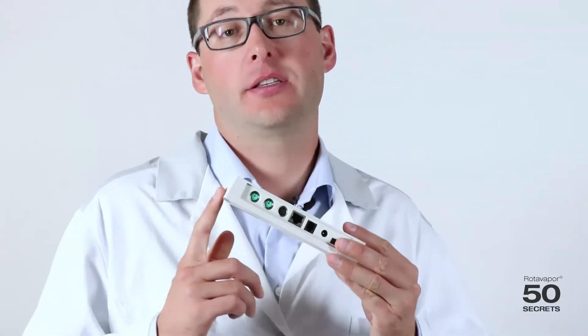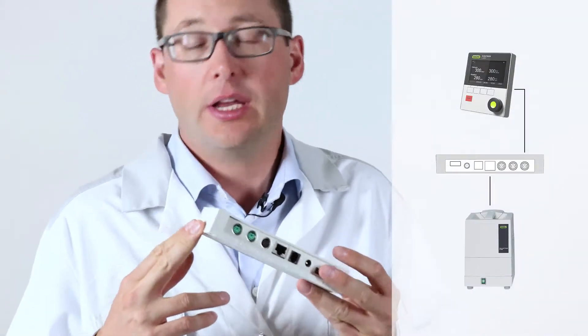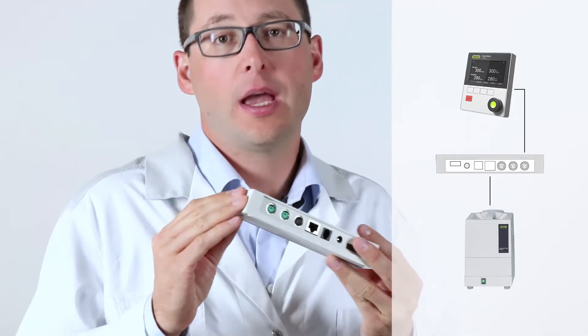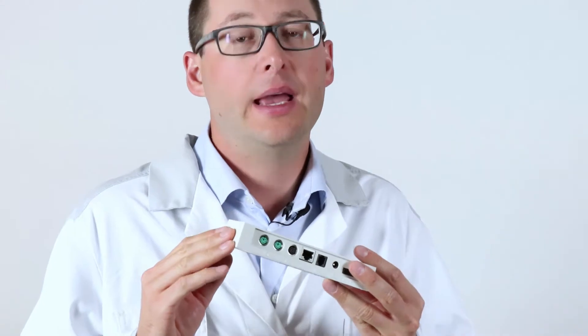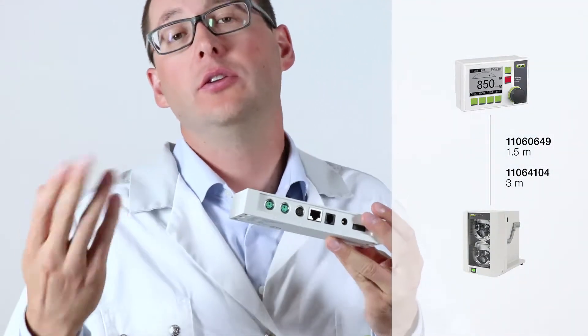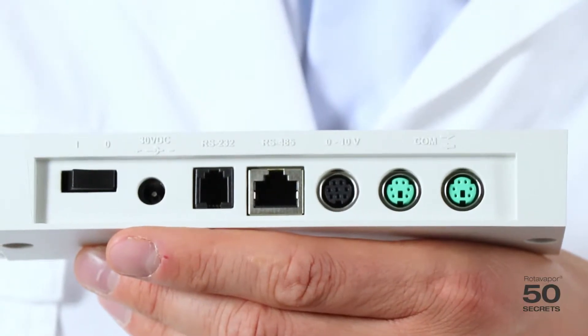Today's secret is very technical. It's all about the legacy box. The legacy box actually acts like a translator between older and newer generations of peripherals. The legacy box is only needed if you have a new interface and old peripherals, such as a vacuum pump or a chiller, and it is not needed if you have an old interface and new peripherals. Let's look into the details of the legacy box.